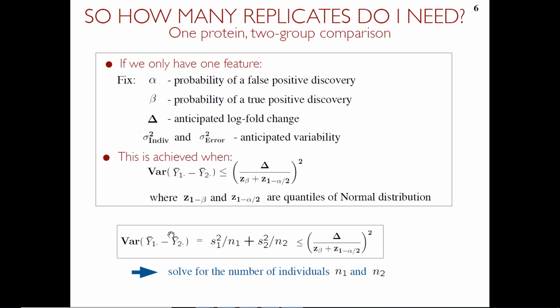So how do we calculate the sample size? And there are really two ways of doing this. This is a very classical, traditional way to do this, which is really a one-liner in R, for example. And in fact, in MSstats, this is what we use. We use this type of calculation.